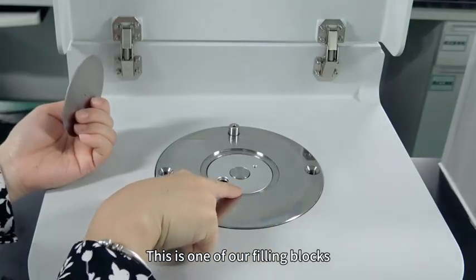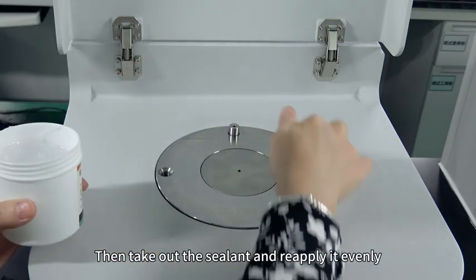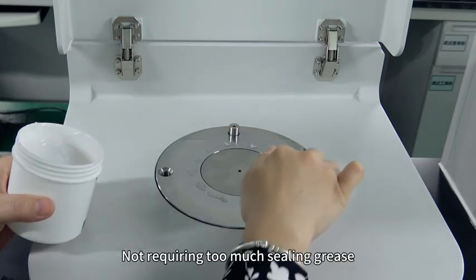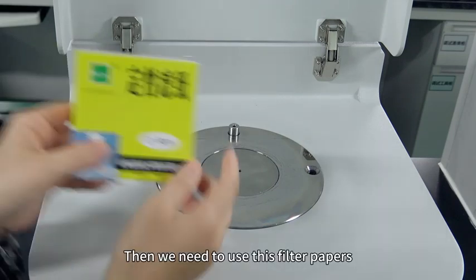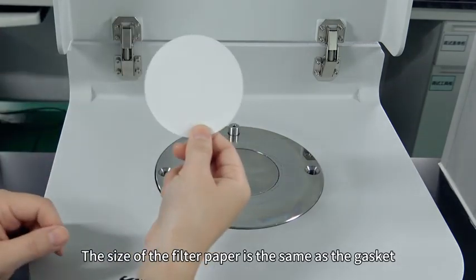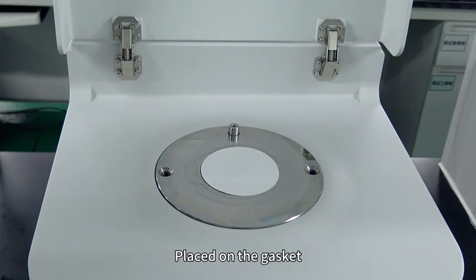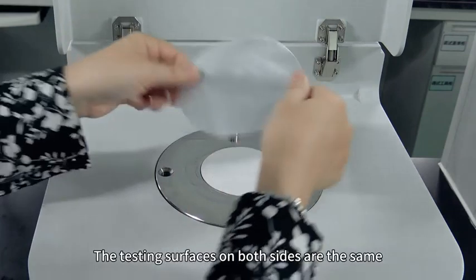This is one of our filling blocks; this is a gasket. Take out the sealant and reapply it evenly — do not apply to the inner edges. Not too much sealing grease; just apply it evenly. Then we need to use these filter papers — the size of the filter paper is the same as the gasket — placed on the gasket.